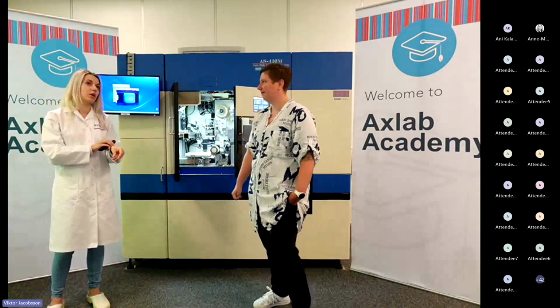That is actually something the blade mark detection is geared to do, and we can fine tune it. There is currently a new feature called retry, and that function will, if it hits a blade mark and flags it as red, go in and retry that specific section. So that is something it could do.